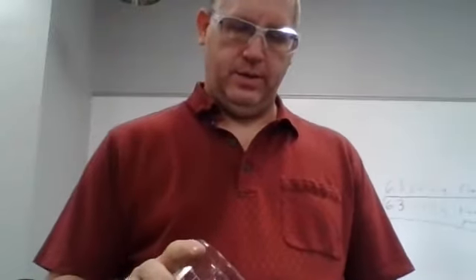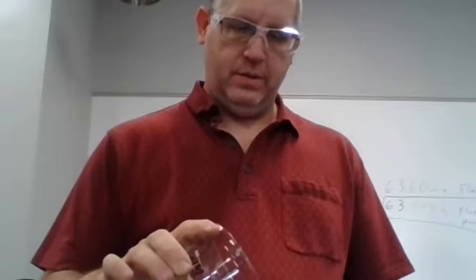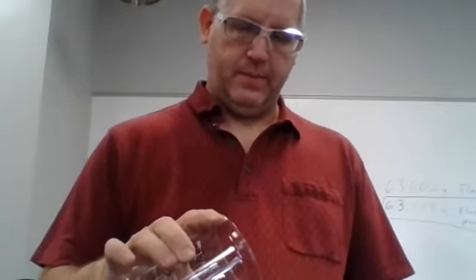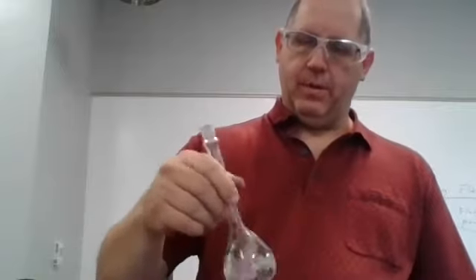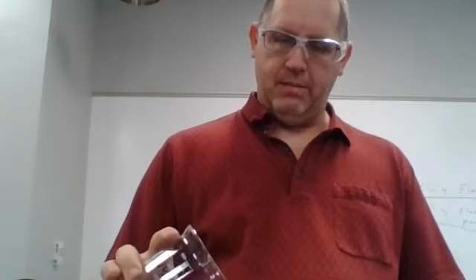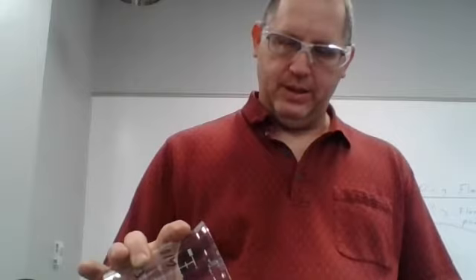Add our nitric acid to our iron solution, diluting it. Now, in general, it's a good idea to go ahead and mix it up some before you fill it all the way. That way you don't have to invert it quite so many times. Makes it a little easier, although you can wait till the final time and just deal with it.